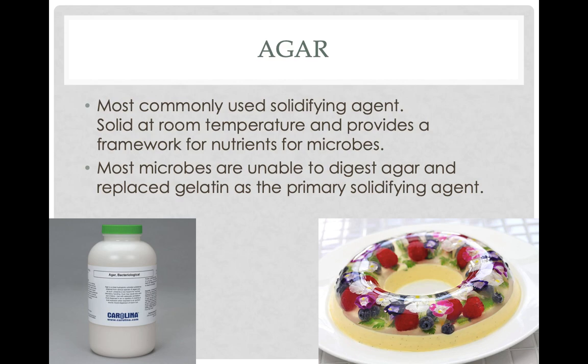So media is essentially Jello. If you guys know anything about Jello, it has gelatin, which is the solidifying agent that makes everything nice and squishy and solid inside. And then you add your flavoring agents and water and things like that, sugar and whatnot. Agar is essentially the gelatin for microbiology.